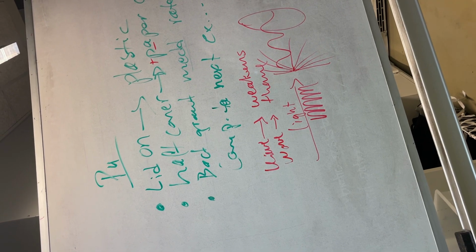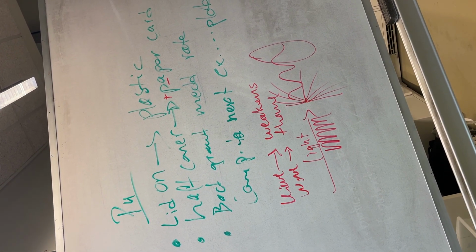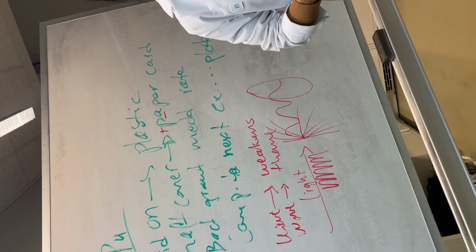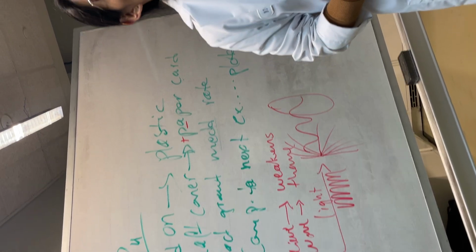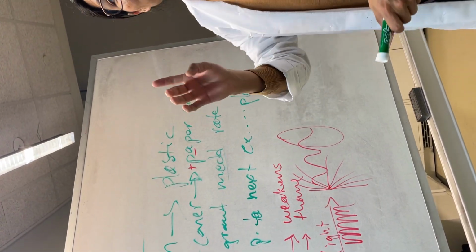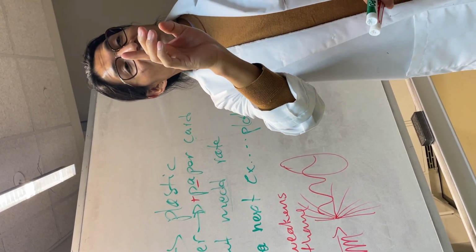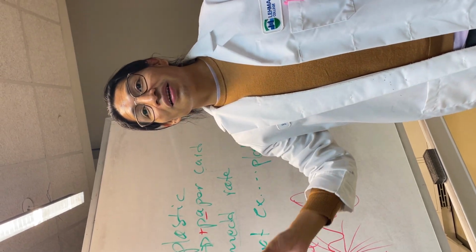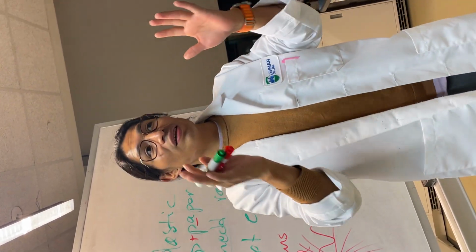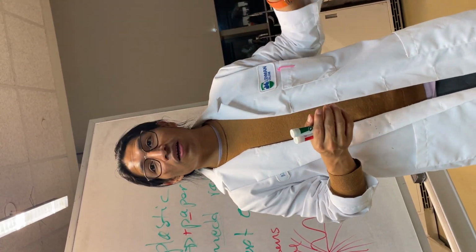I get how that can play a role in the plastic, but would the bacteria have other properties? Because our bacteria, we have a lot of colonies in 4. Yeah, absolutely. They will have other properties depending on the bacteria. So therefore, UV light is not universal. It doesn't work for every single bacteria. That's why it's ideal if you can check it in other places that have different bacteria.